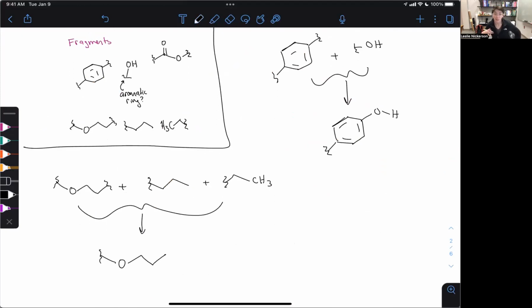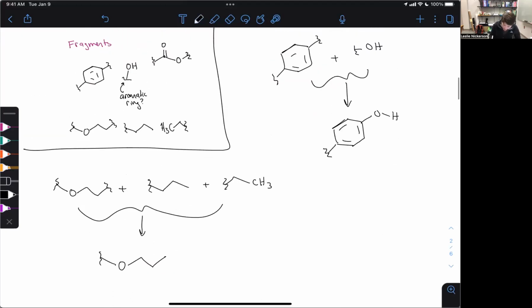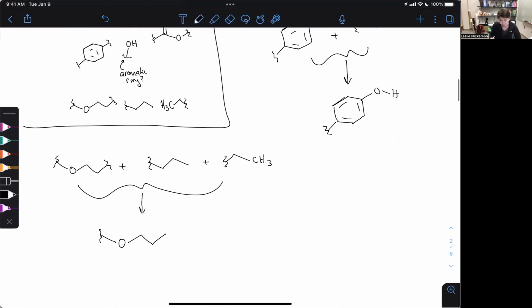So I would say another very reasonable, we're gonna drop 2 reasonable options. Okay, so this is possibly attached to an oxygen. We could also think about, is it attached to a carbonyl? Okay, so we're gonna drop a couple options because at some point you have to have your pieces around fragments that have more connections on them.